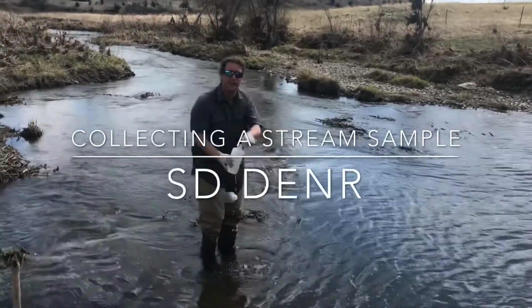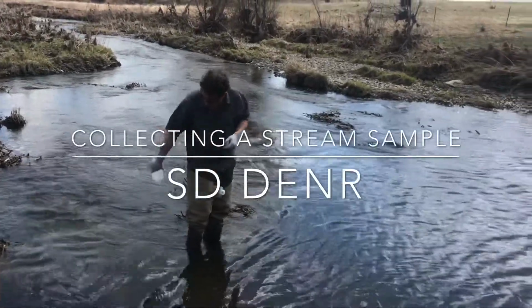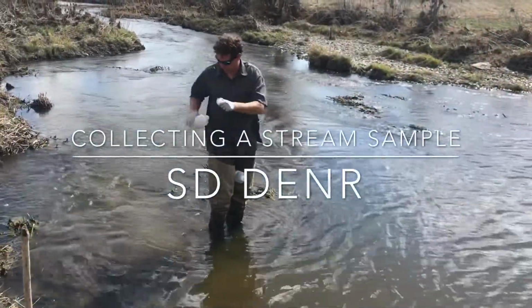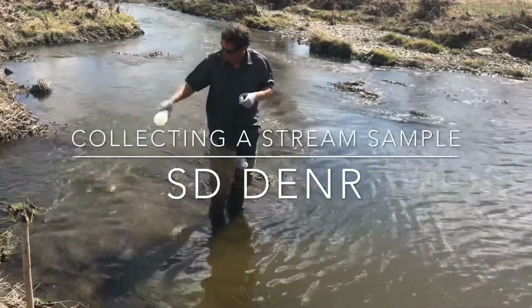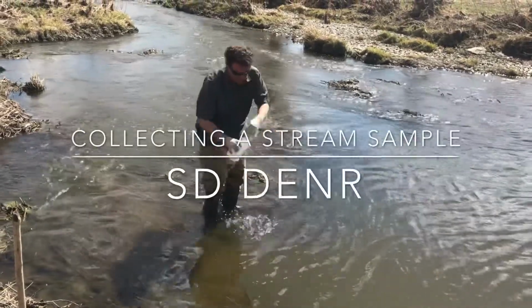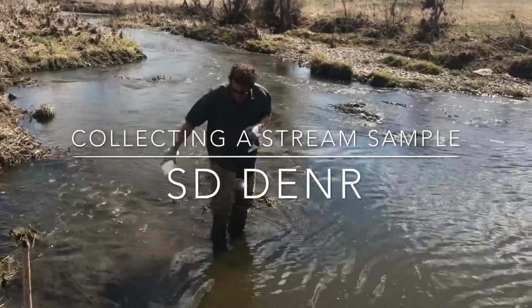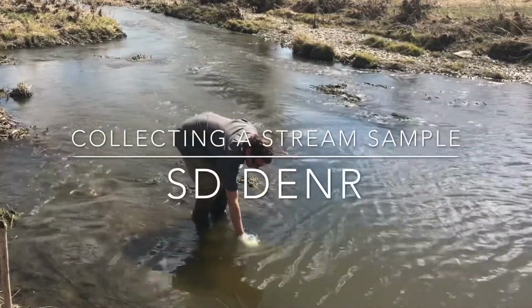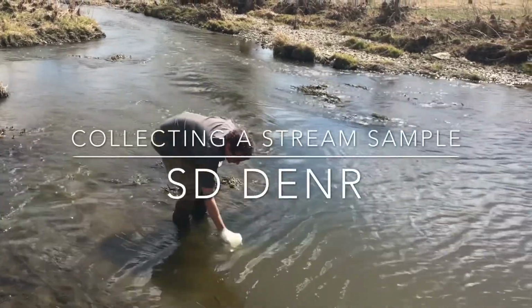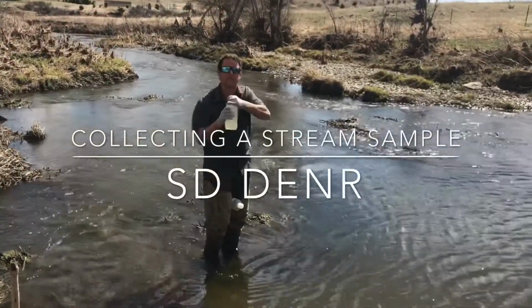Again, we face into the current and triple rinse. I like to do that little flick at the end to get any last water out of the bottle. I don't know if that was 2 or 3, but if you do it one extra time, that's okay. That bottle's rinsed. Now we're going to fill it. Again, just up to the shoulder. And put the lid on.